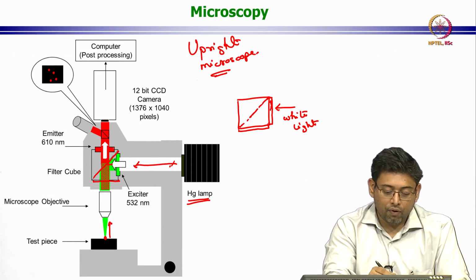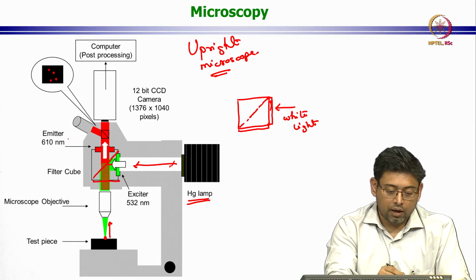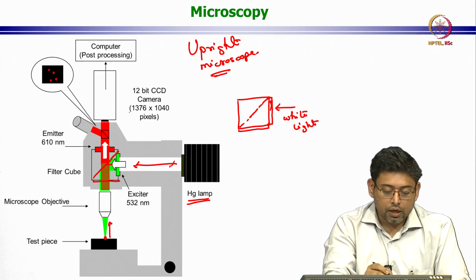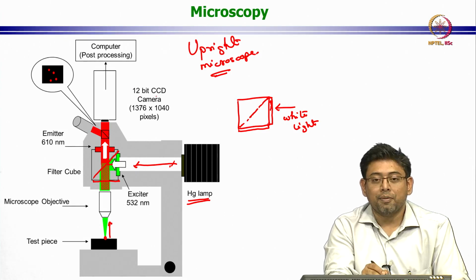And then finally, we have one more optical element here, which cleans out the light such that you only have wavelengths that are close to the emitting wavelength going into my camera. So once this light enters, these are some of the cameras we used to use.